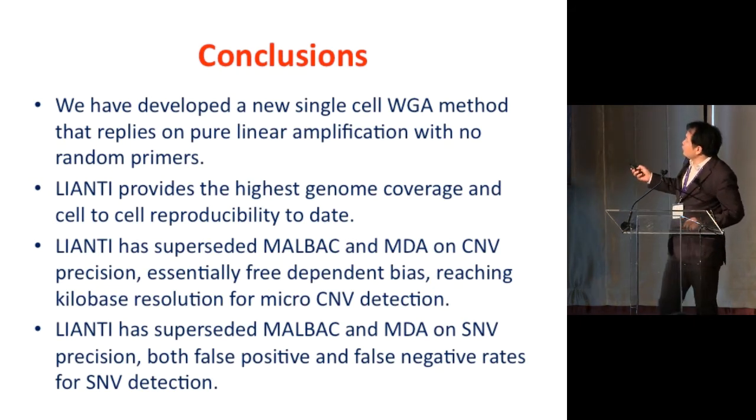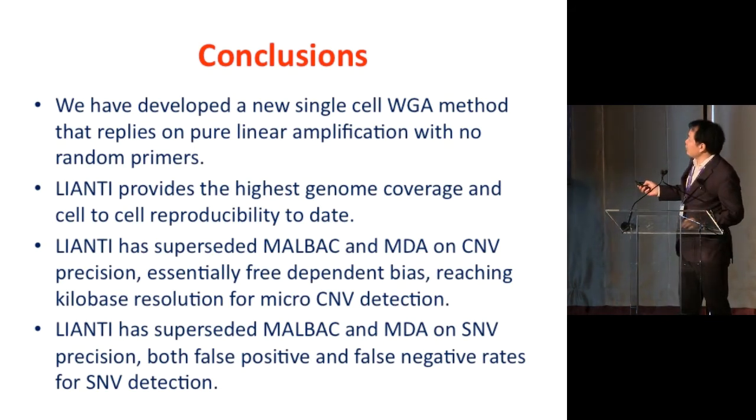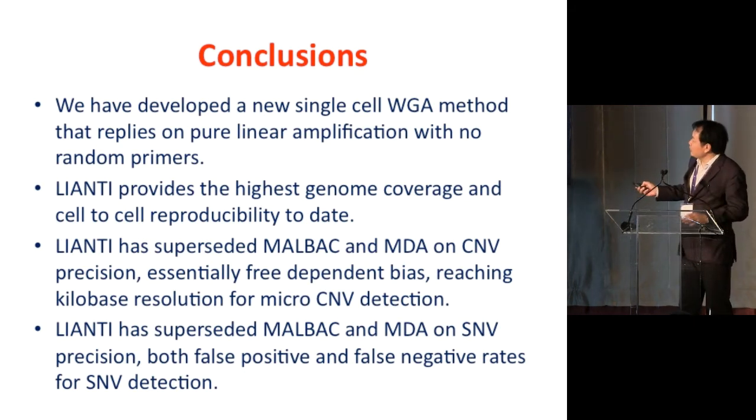We have developed a new single-cell whole genome amplification method that relies on pure linear amplification with no random primers, but very random insertion of transposons. So LIANTI provides the highest genome coverage. We can easily get 99%. And it has good cell-to-cell reproducibility.